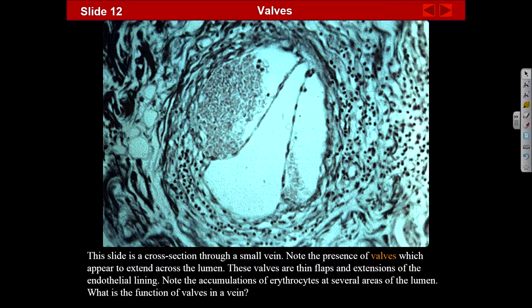They're probably lymphocytes. Blood's still got leukocytes in it, right? And actually, these look like they're outside of the vessel. These look like they're in the connective tissue space for whatever reason. Yes. Like here, see here? But it would be all this and none of this.